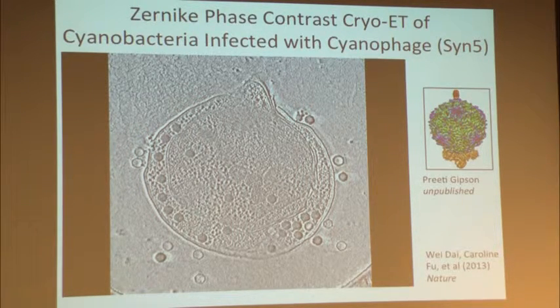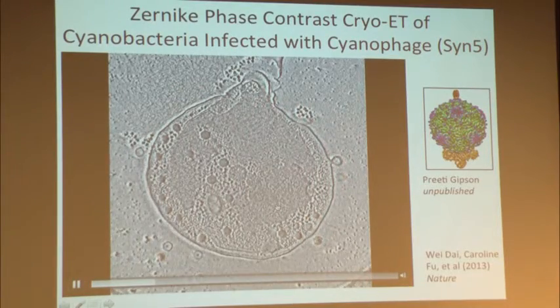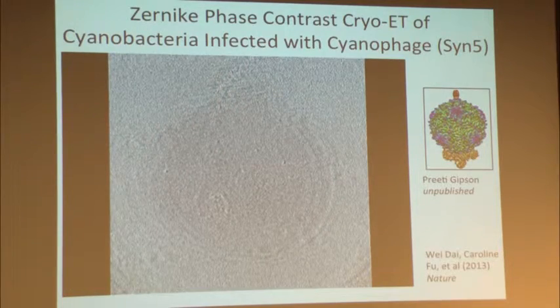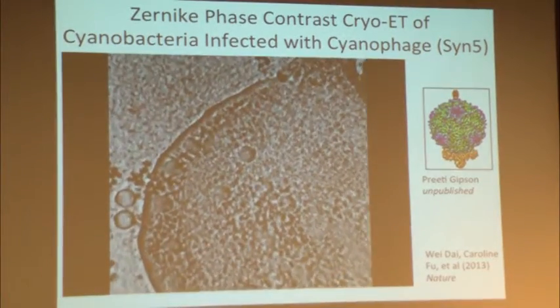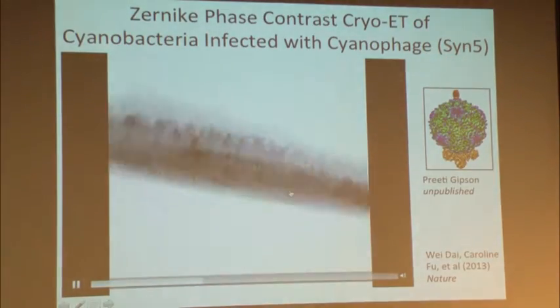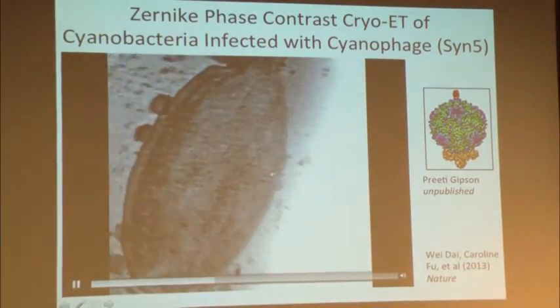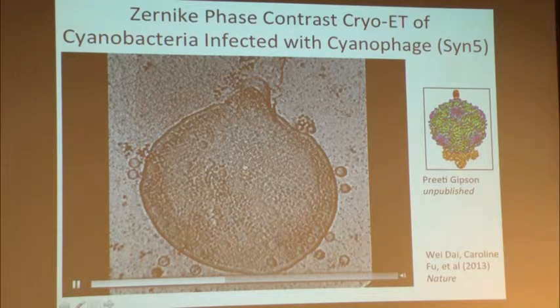So anyway, we can see all these things in here, and from there, what we do is annotate this into different features. In the bottom rendering we see each of the individual pixels, and you see there's some virus particle on the outside, and now I'm flipping around, and then eventually I'm going to color code the different features that I understand.